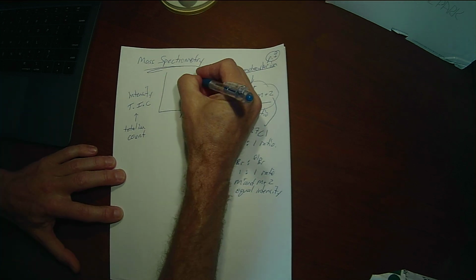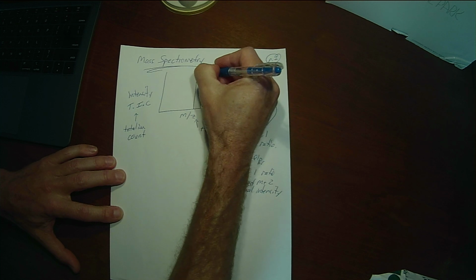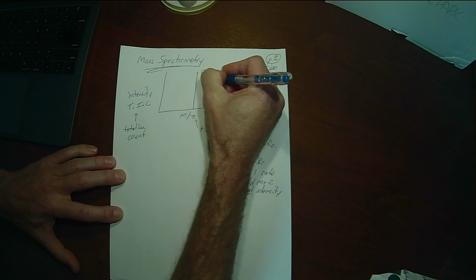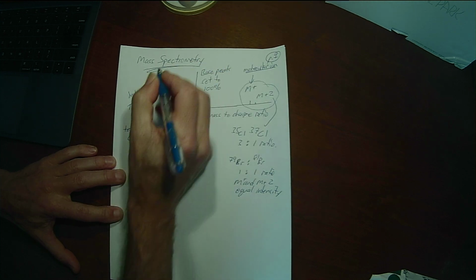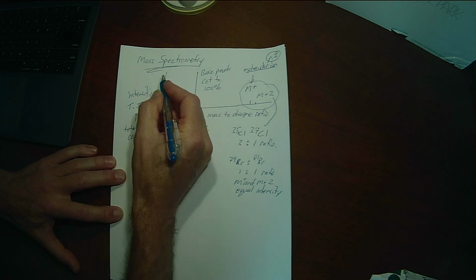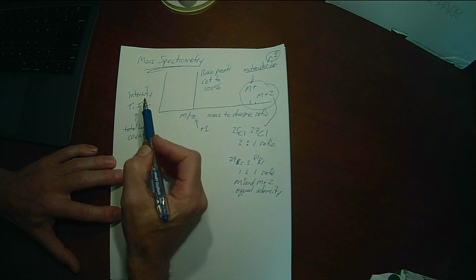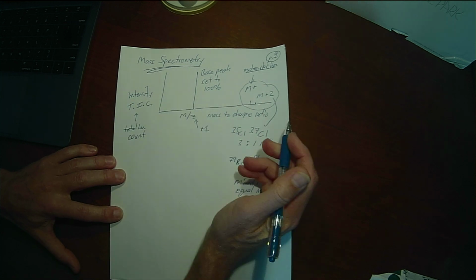And then the other definition is what we call the base peak. And that's the one we set to 100%. So with our total intensity, we're not actually measuring the total ion count here. We're measuring a ratio of the total ion count for the fragment to the total ion count for the base peak.